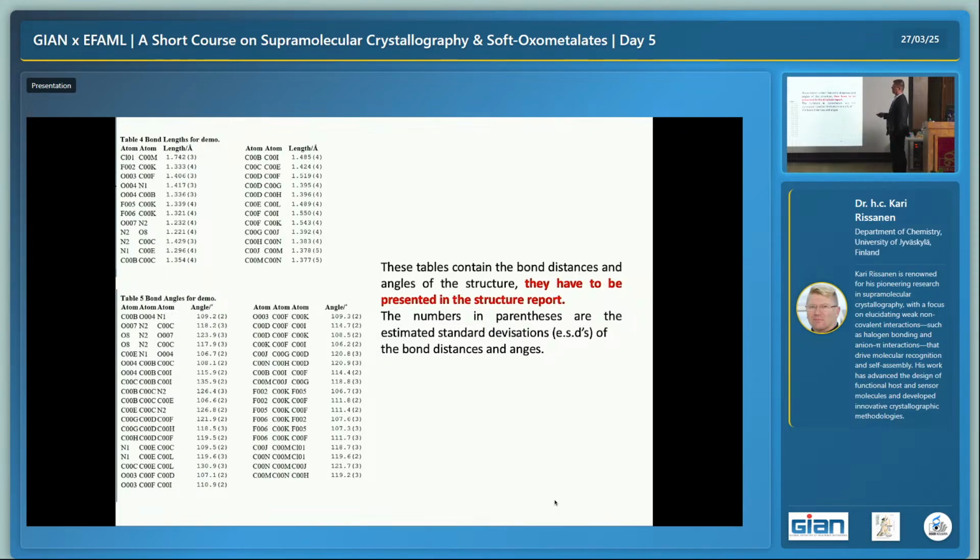So that is printed. Here we can see the nitro group, the O-nitrogen-O distance, is clearly shorter than the carbon-carbon and carbon-nitrogen bonds. Now in here we have another table which is actually coming from the coordinates. This is the angles. You can see there are more angles than this, of course, because we can have an angle in this direction or that direction.